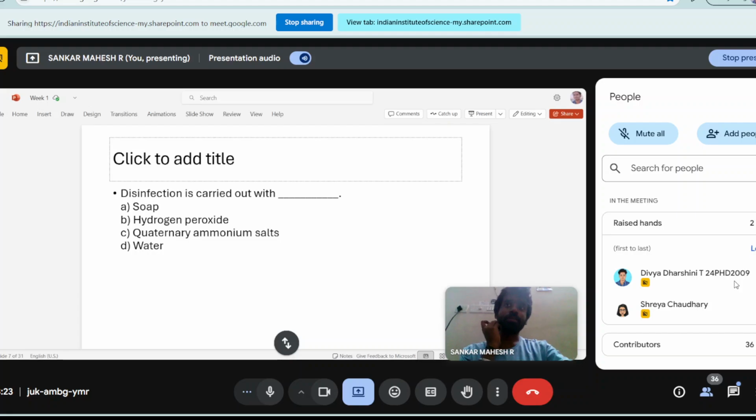How would something make it harmless? Is it alive or dead? I think it's alive. Sterilization is something in which they are completely non-viable. One thing that you mentioned was right. Disinfection is usually meant for some particular surface, whereas in sterilization you want it completely free of microbes. Disinfection is just to ensure that there is nothing pathogenic on the surface that you are working with. An example is when you apply ethanol on surfaces to wipe them just to ensure that they are clean. That is disinfection.